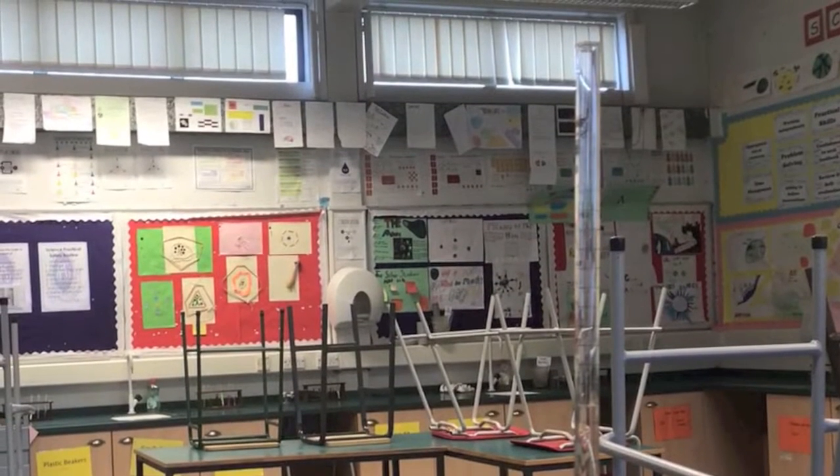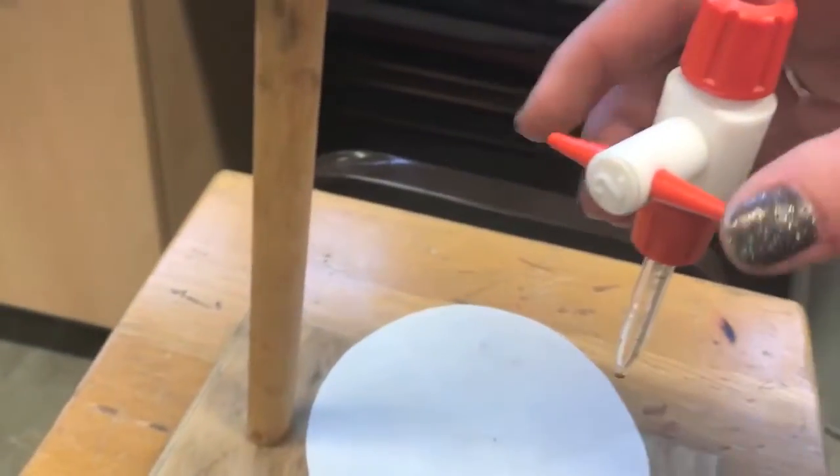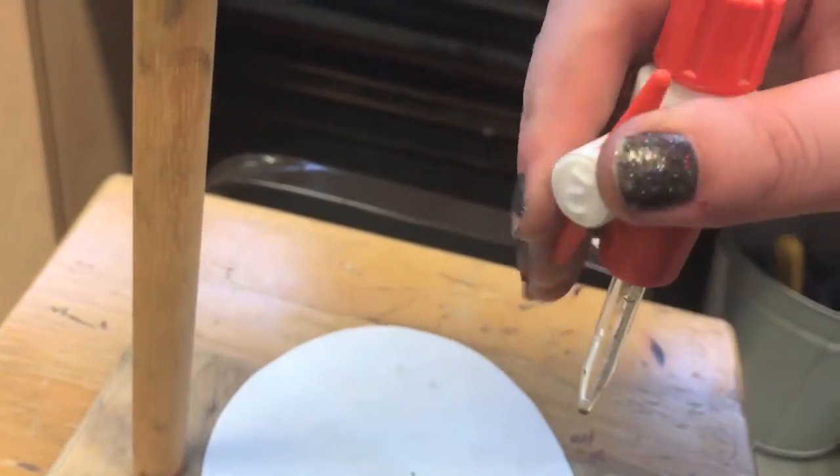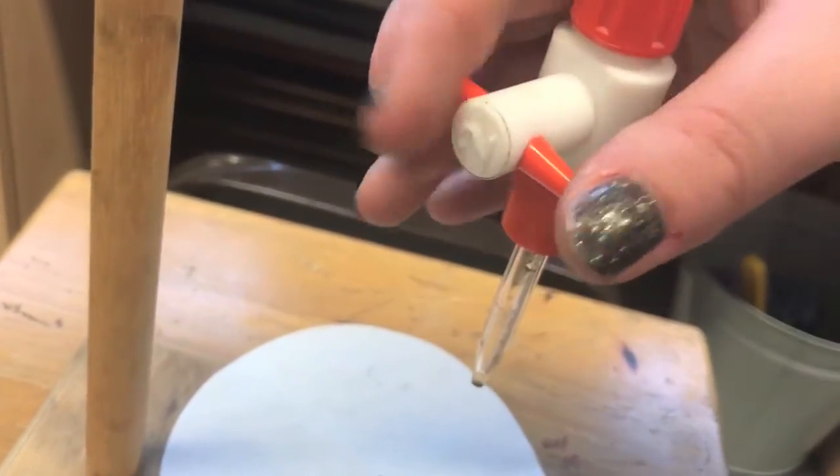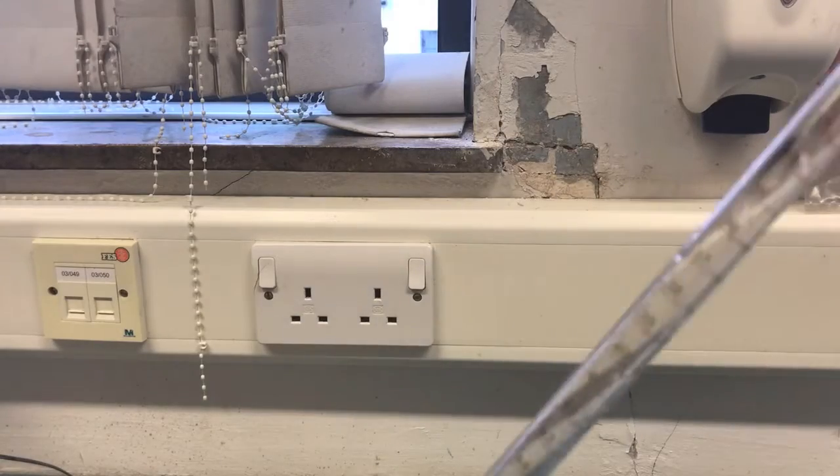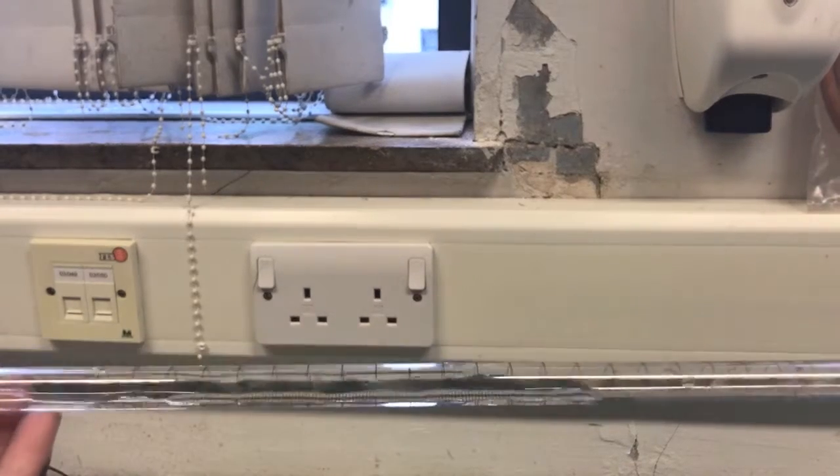The burette must first be rinsed with a little of the solution which will be used to fill it. Make sure the tap is closed before doing this. On this burette the tap is open when it is in line with the burette and closed when it is horizontal. The burette is turned on its side and rotated to rinse the whole burette using the minimum volume of solution.